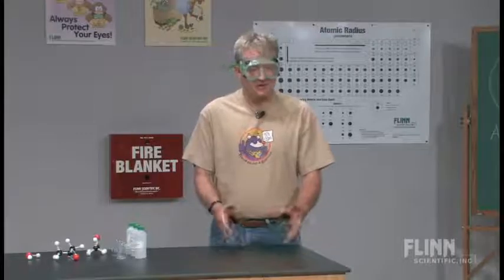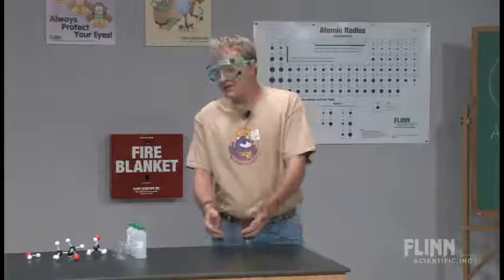In the chemistry textbooks, there's a section on vapor pressure, and some students have a sense of what it's all about, some don't. There's also a section on heat of vaporization and rates of evaporation, etc. And I've always looked for demonstrations that kind of illustrate that and get kids a little bit more involved. I saw this the first time, I believe, at an NSTA convention in Dallas.